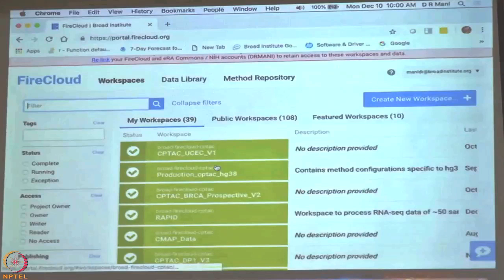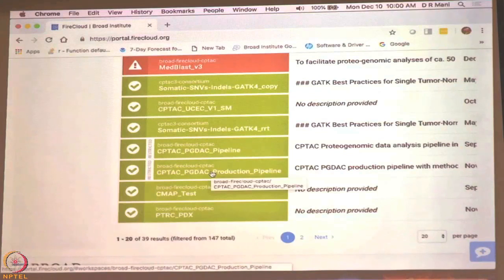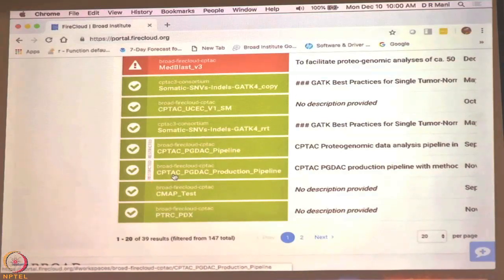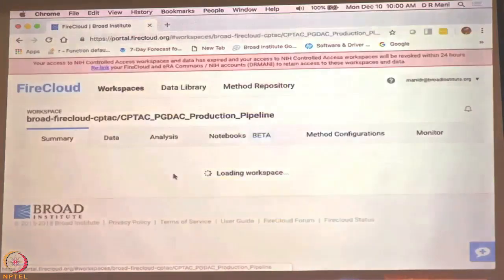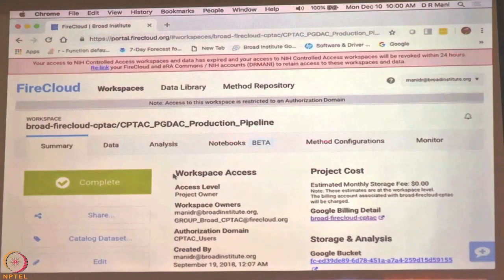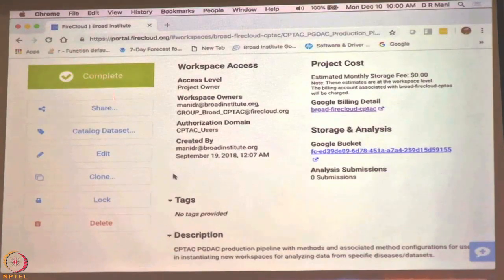I will pick a workspace and we can take a look at it. You can see there is a workspace called CPTAC PGDAC production pipeline — that is our collection of pipelines for the proteogenomic data analysis for all the CPTAC projects. It says restricted because only people at the Broad currently have access to it. If you click on that, this is the summary page for that workspace. You can see the workspace has data, analysis, notebooks, method configurations, and when a process is running you can monitor what is happening. On the left side it shows the last process run has completed successfully, shown in green. If it did not complete successfully, you will have a red triangle.